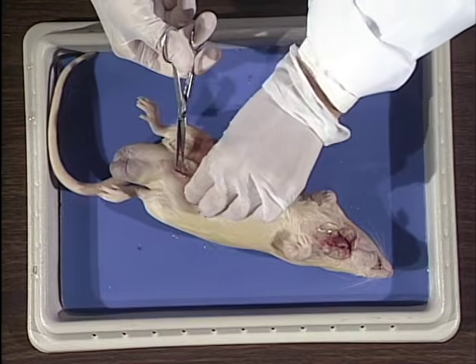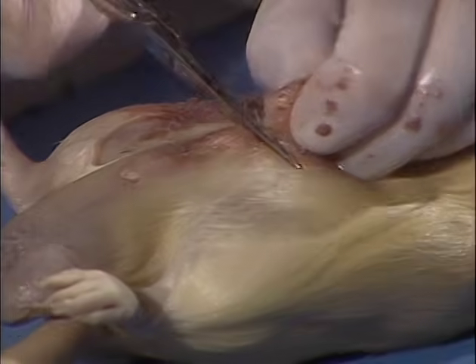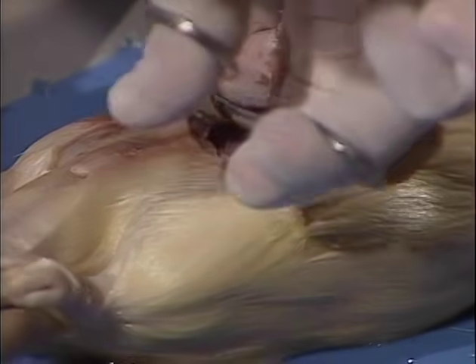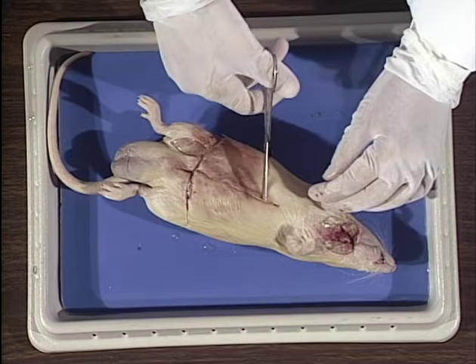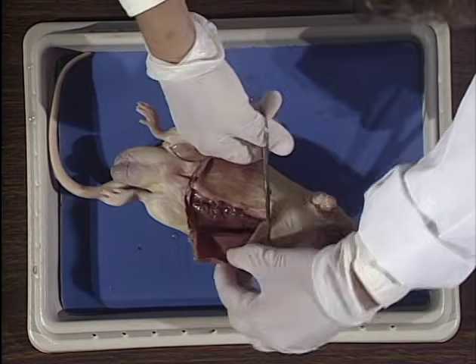One will be cranial to the lower limbs, the second transverse cut will be made caudal to the upper limbs.